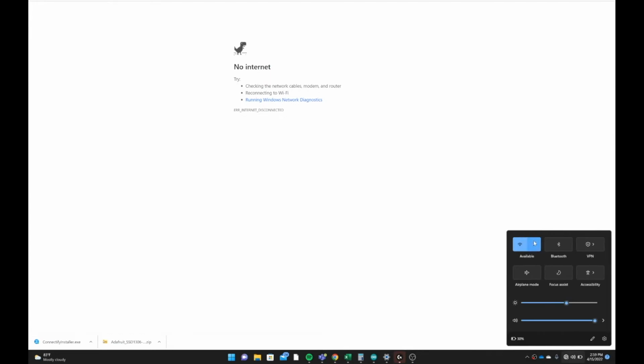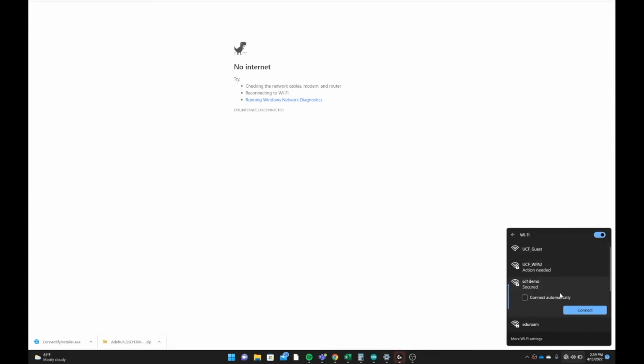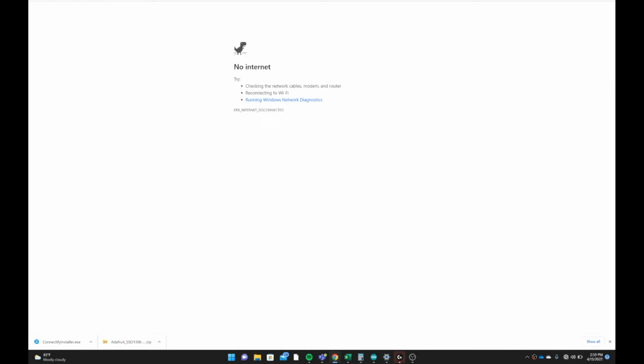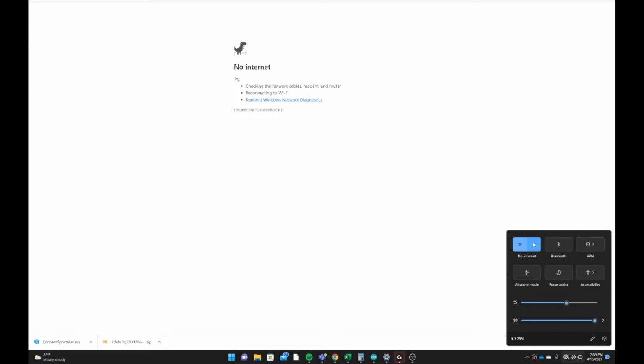The device is also capable of being accessed by a remote web UI. By connecting to the device's SD1 demo Wi-Fi network, we can then pull up a web page that will allow us to take readings and view the readings.